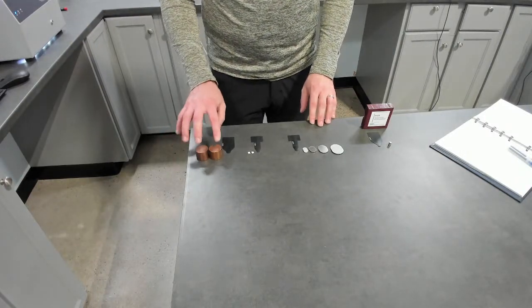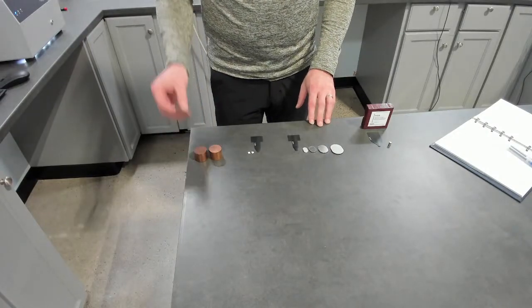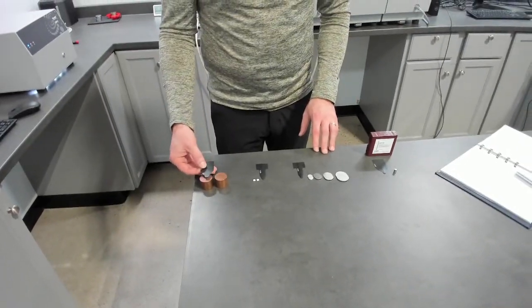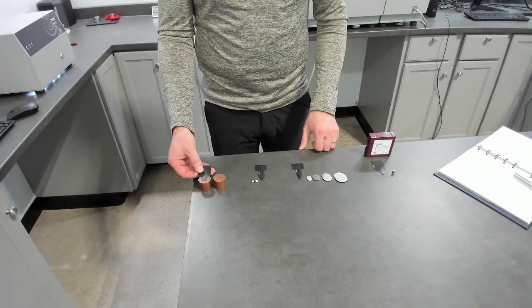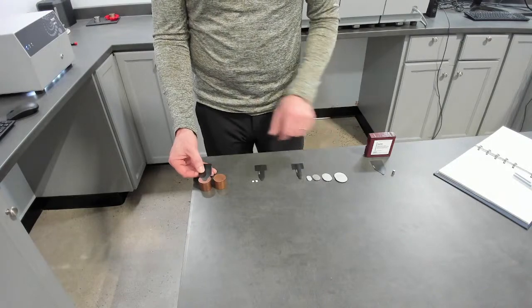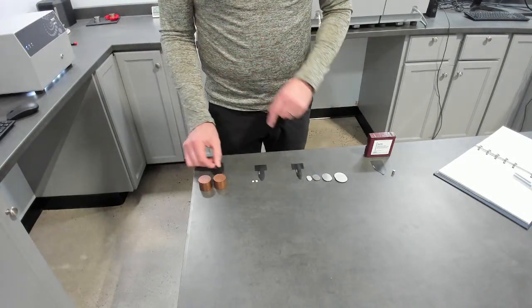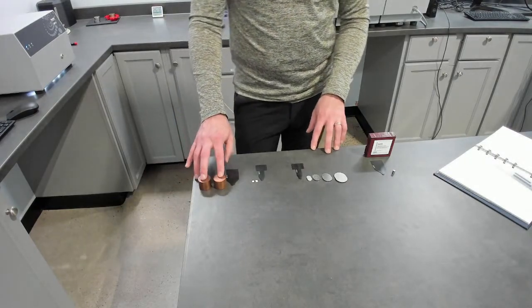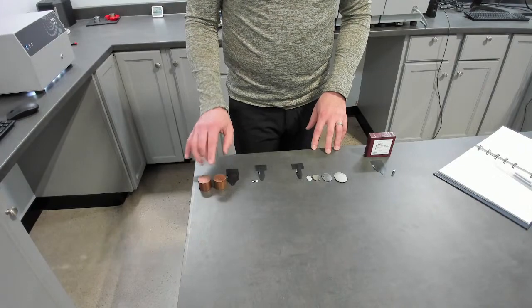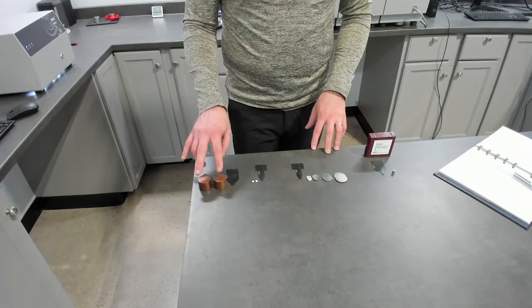And even though these are large in size, about 35 millimeters in diameter, the sensor that we would propose to use in this example is 6.4 millimeters diameter, or 3.2 millimeters radius. That leaves what looks like quite a bit of penetration depth. But if you were to look at a measurement, you would see that we need a test time of 0.25 seconds to keep the heat within the boundaries of the sample, based off the really high diffusivity of these materials.